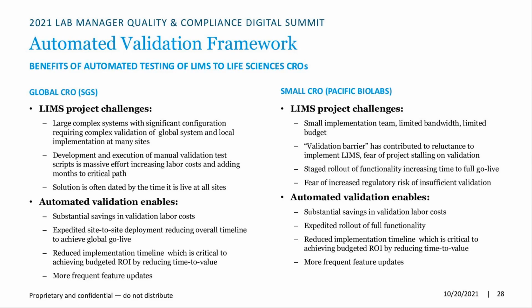Small company challenges are at the opposite end of the scale. We have extremely small implementation teams, limited bandwidth because they have a lot of responsibilities, and of course limited budget. I talked about this validation barrier. There was a reluctance here at Pacific Biolabs to implement a LIMS.